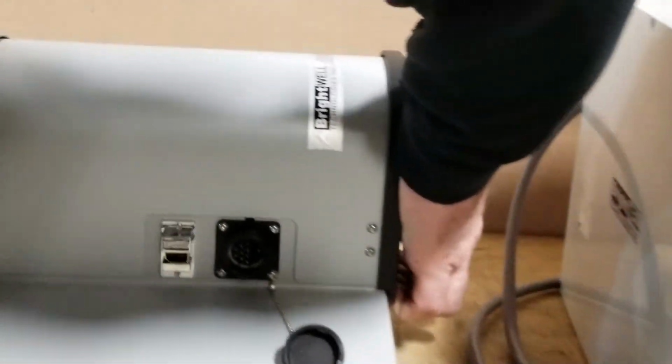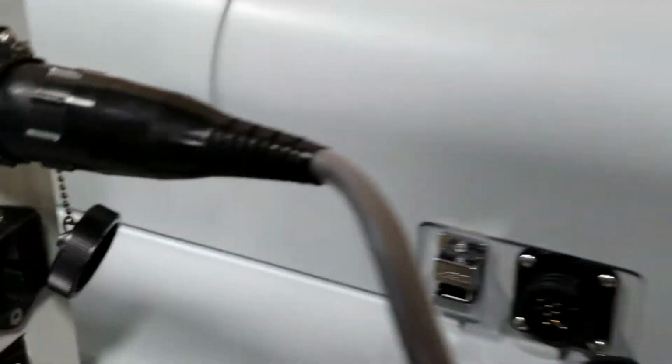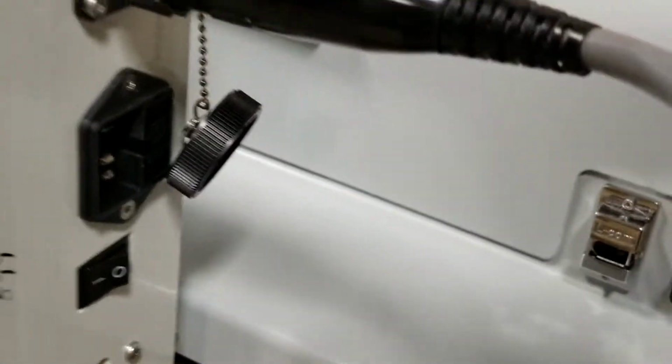You want to put this in the forefront and anything on the bottom? On the bottom of this? Yeah. Feet. Adjustable feet. Adjustable leveling feet, okay. Then we have this. You can see it. The cord was still, you can see it's never been used, but we don't know anything further than that.